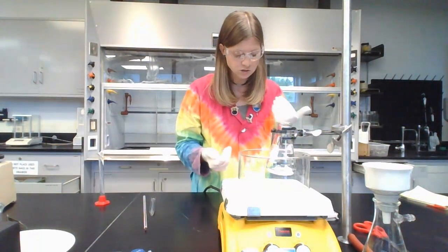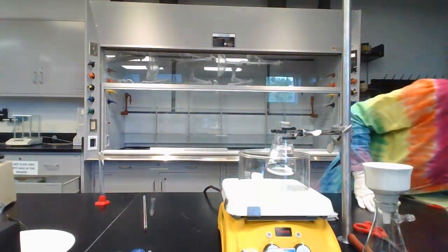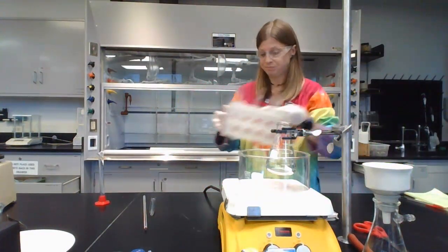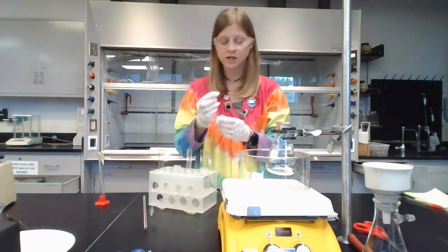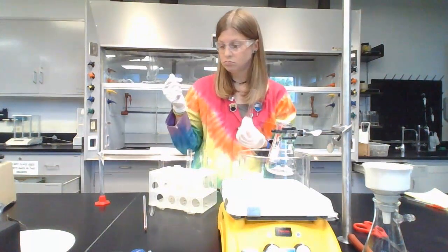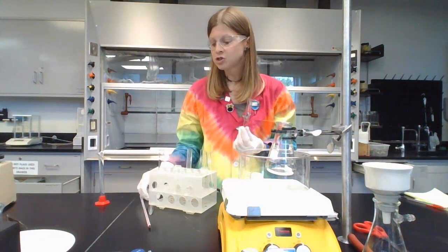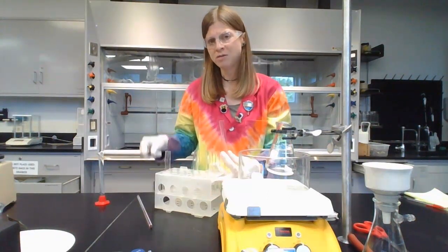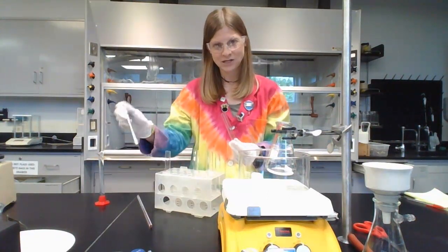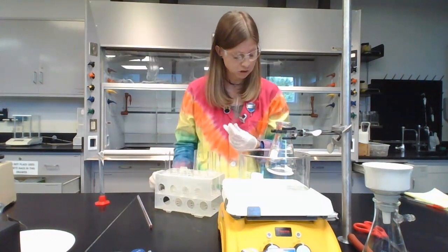So what we're going to do is start the phenol, the color test. Okay, so we're going to need some test tubes. So you're going to get an empty test tube, and you're going to get the bottle of pure aspirin, which will be labeled, and it says transfer a few crystals. So that means like a tiny, tiny bit. Okay, just a tiny, tiny bit of it, and put it in the test tube with a nice clean spatula.